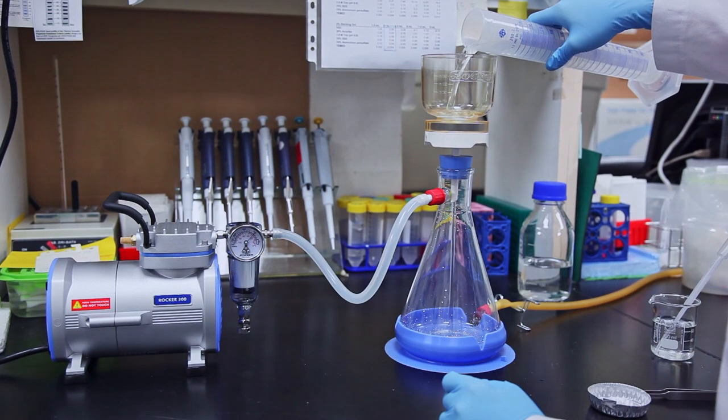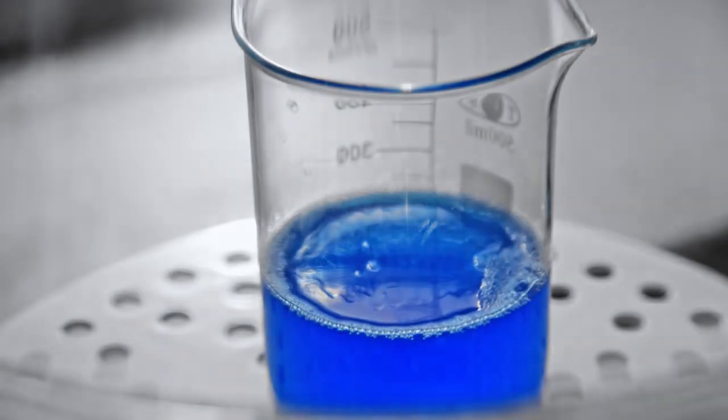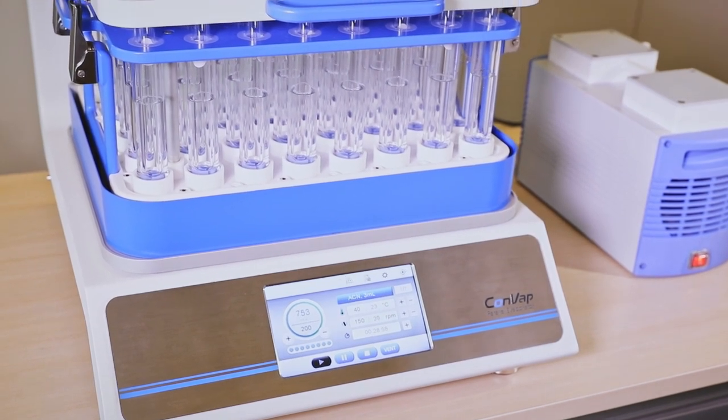Vacuum pumps are widely used in many fields that we're familiar with, like filtration, aspiration, or degassing. They can also be used with other instruments to accelerate processes like extraction, concentration, or mass spectrometry.